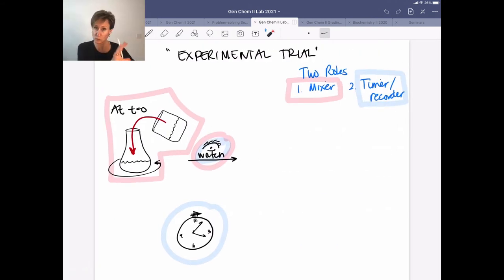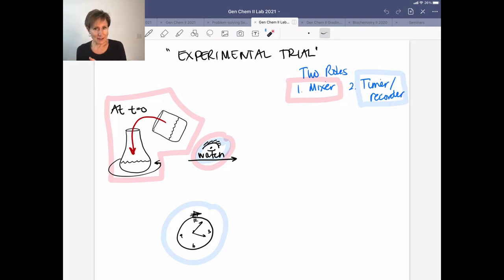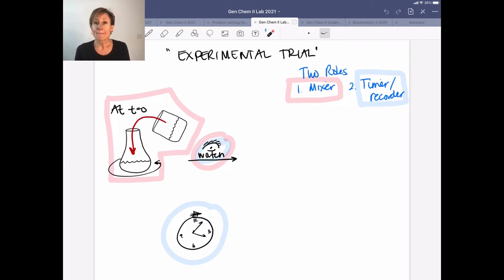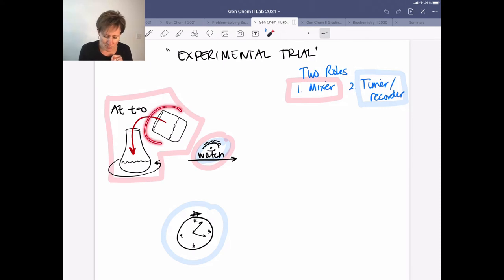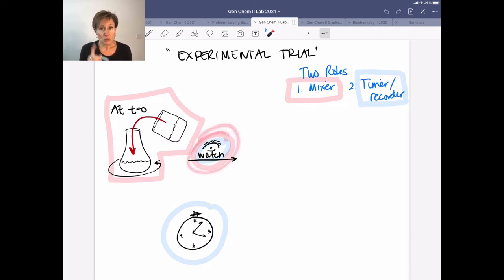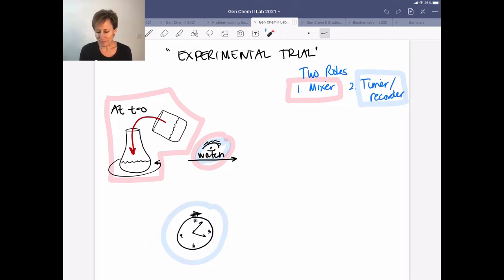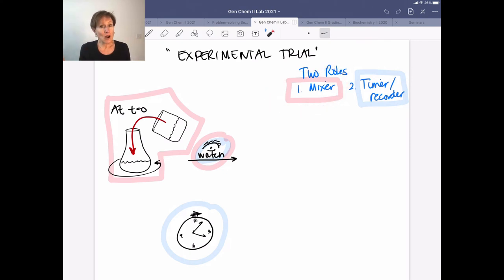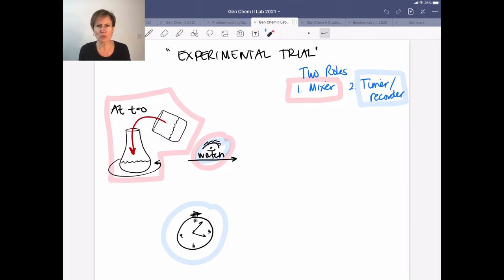Let's talk about how you actually execute this. It's really important to know exactly what you're doing before you start. Use a stopwatch or your phone to measure time. As soon as you start, mix the contents of your beaker into your Erlenmeyer flask and simultaneously press start on your stopwatch. Swirl to mix — you shouldn't need to keep swirling after that — but you do need to watch the solution carefully and keep an eye on the time.